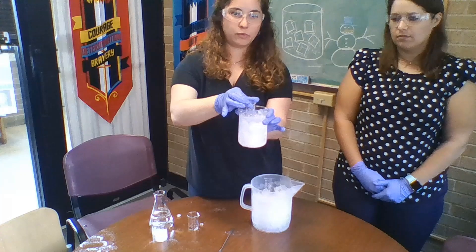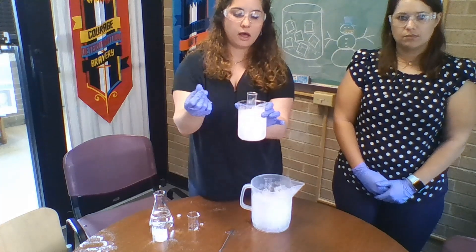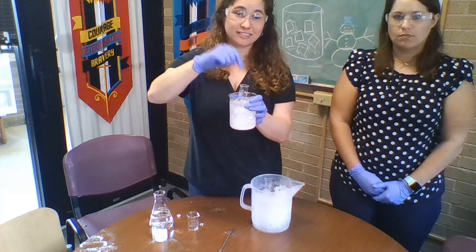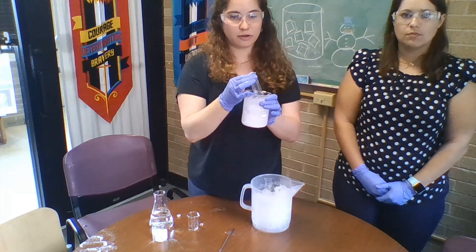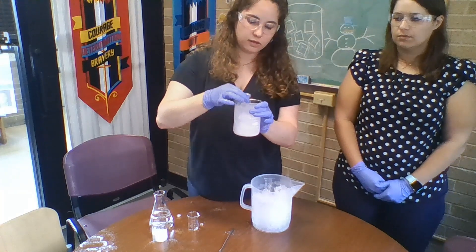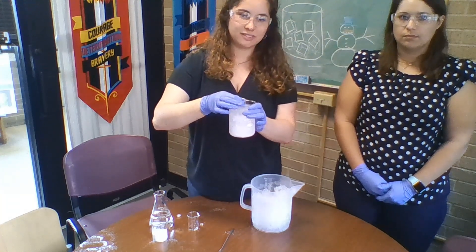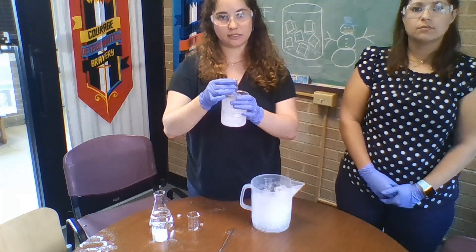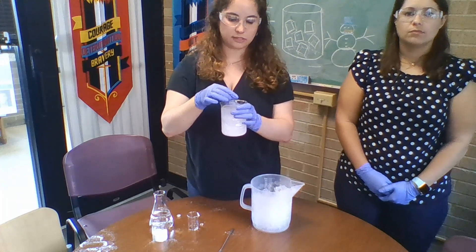Now my entire solution of cyclohexane would be under the water line. It's also important to note that we're using a lot of water here, but if you get water inside your test tube that's another easy way to destroy your experiment. Make sure that the water level comes above the line of your cyclohexane but not above the lip of your test tube, and you're going to clamp it to make sure that happens.